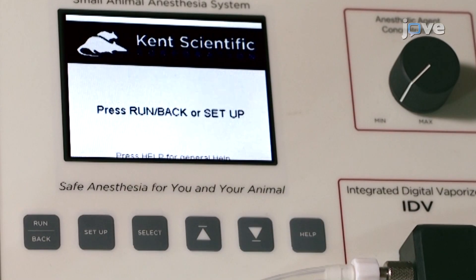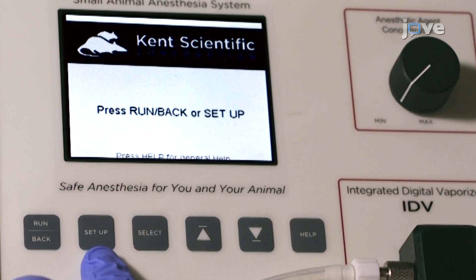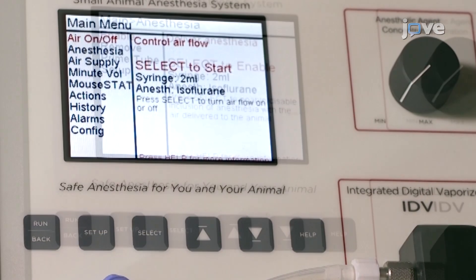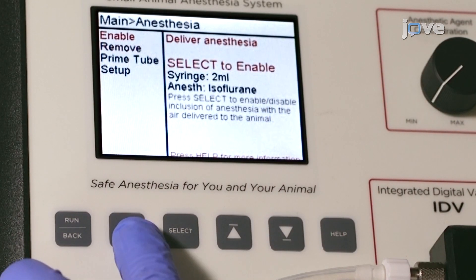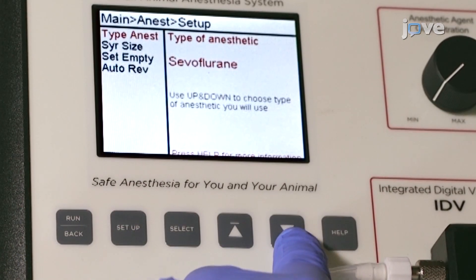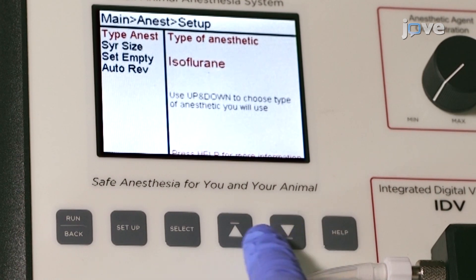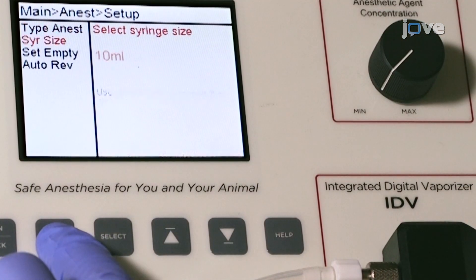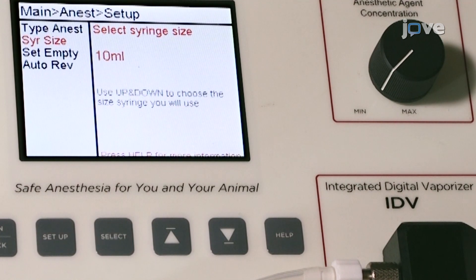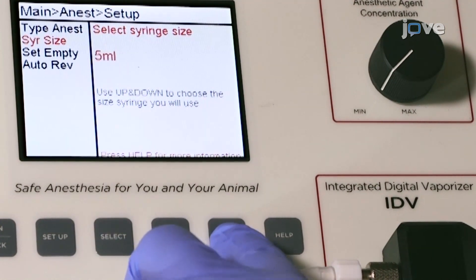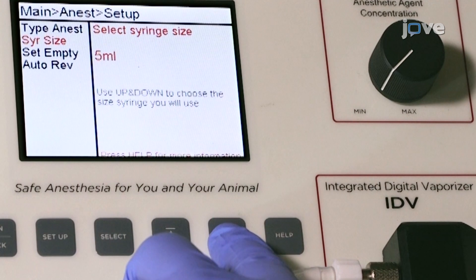Turn on the low-flow anesthesia system to configure the settings. Navigate to the anesthesia setup menu and choose isoflurane. Next, set the syringe size by pressing Setup to highlight syringe size. Use the directional buttons to select a 2 milliliter syringe.